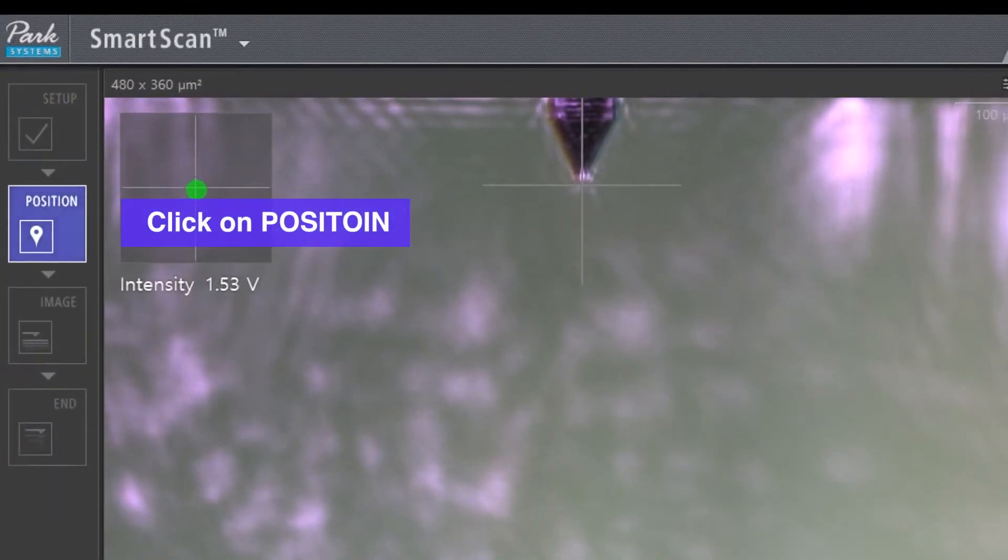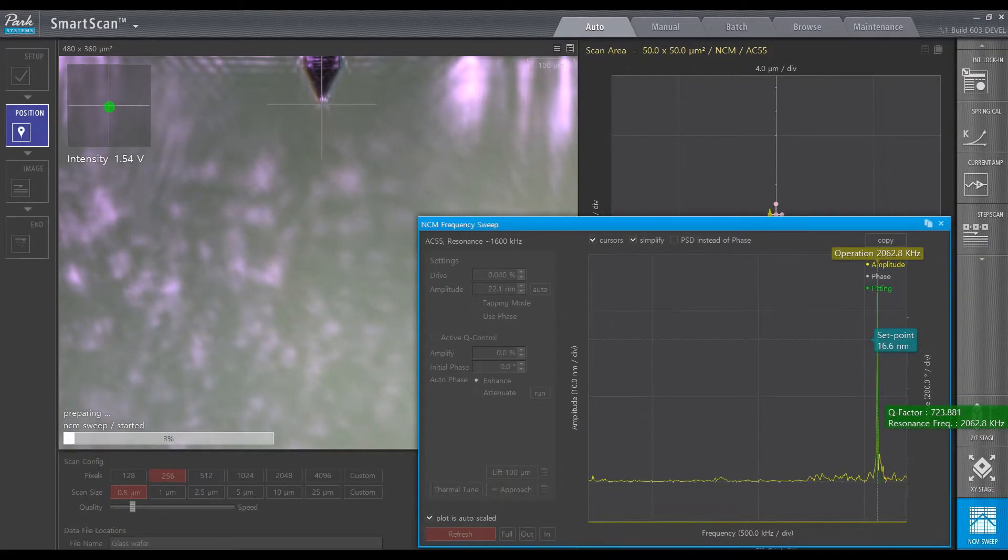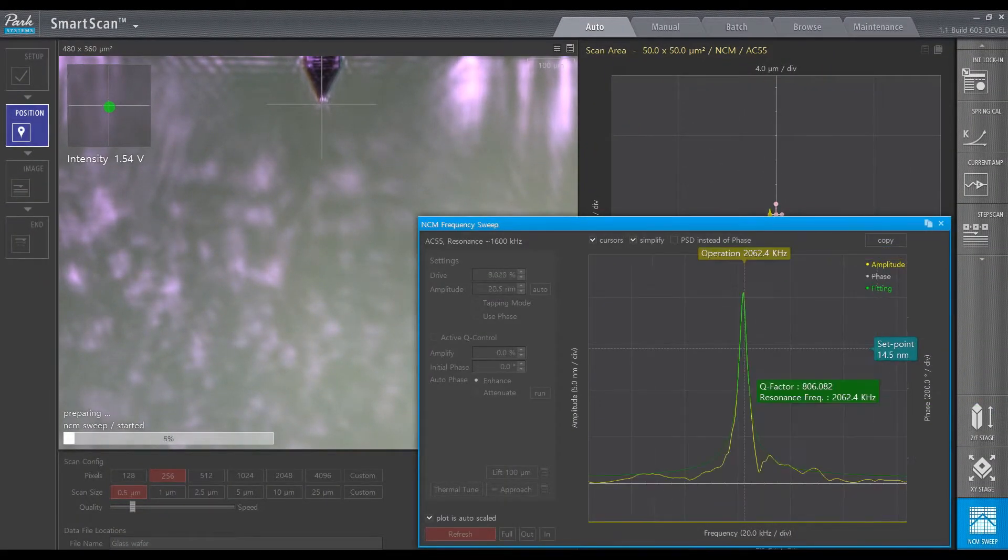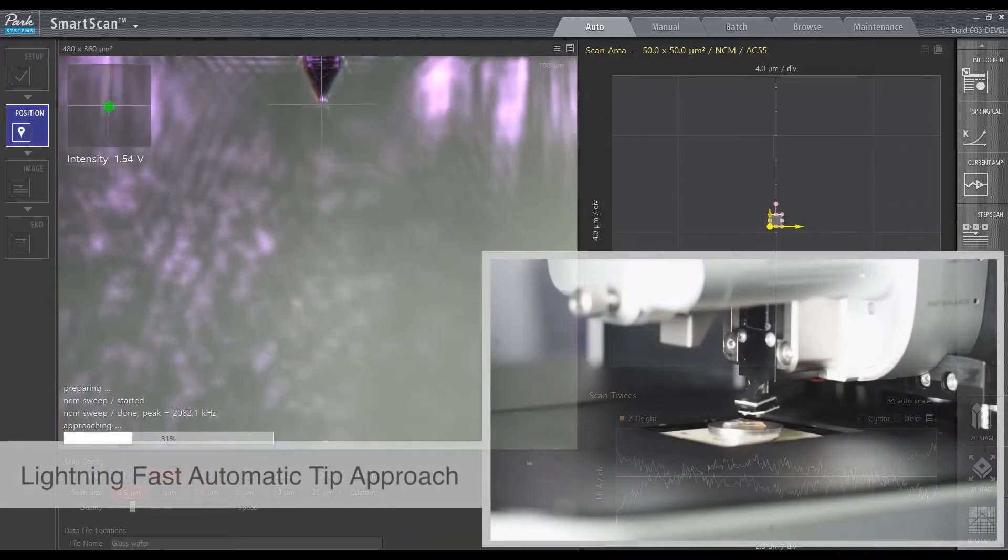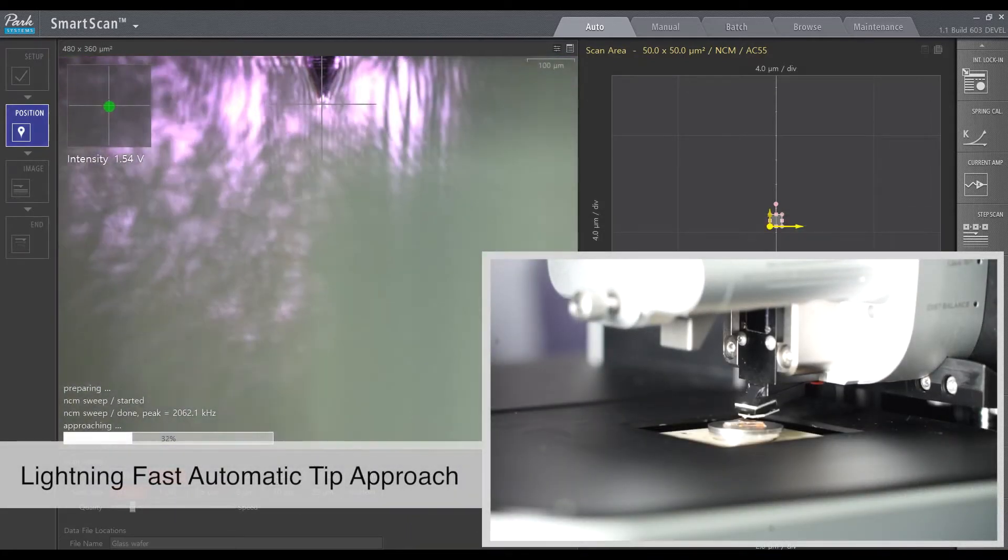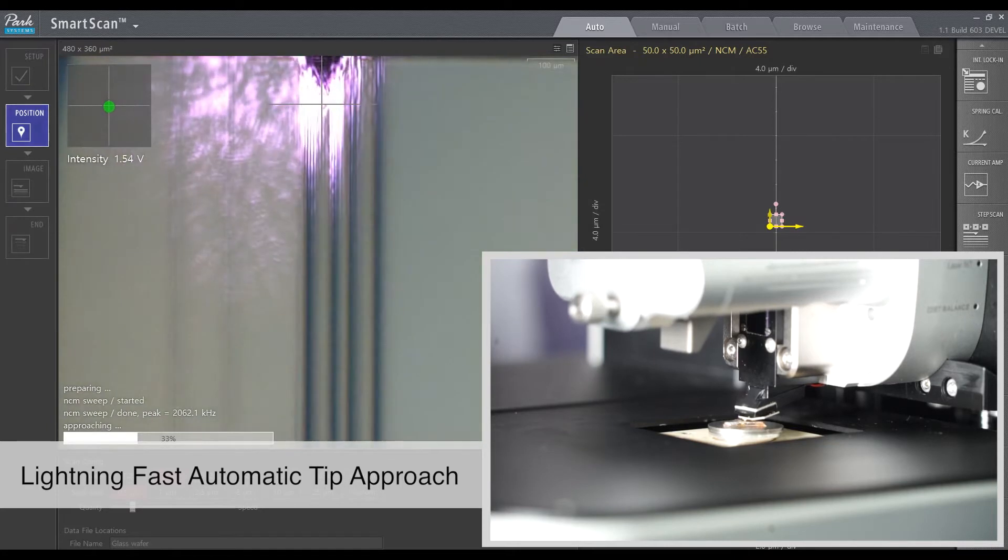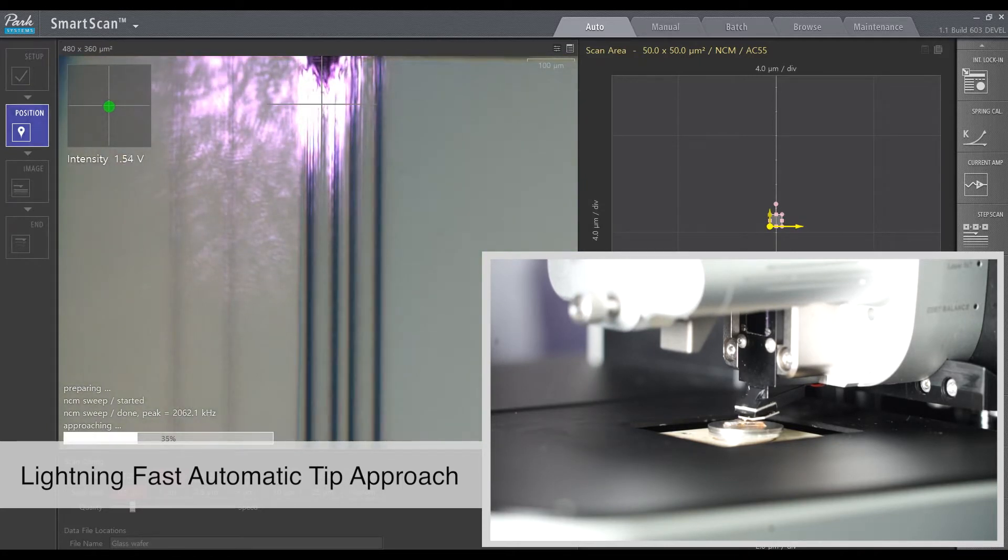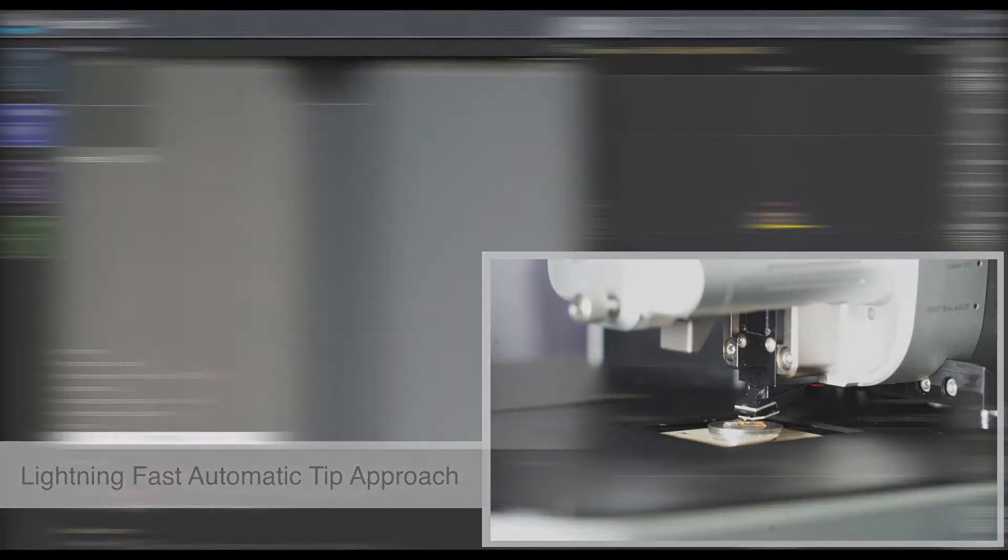Next, click on Position. The system automatically performs the frequency sweep for the cantilever being used, moves the Z-stage to the sample, and auto-focuses on the sample, allowing the user to see and navigate the area of interest for imaging via an optical feed.